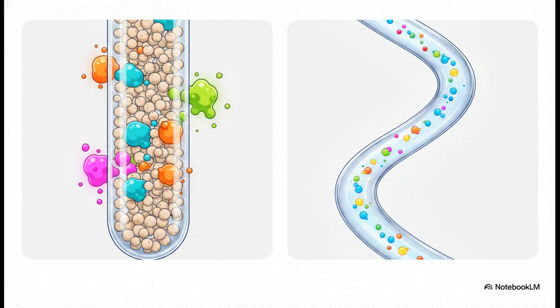Broadly speaking, we have two types of tracks: Packed columns are, well, exactly what they sound like, packed full of solid particles coated in the stationary phase. They are extremely rugged and can handle 10 to 50 times more sample volume. That makes them awesome for bulk industrial gas analysis. But for our tricky apple pesticides, no way. We need a capillary column.